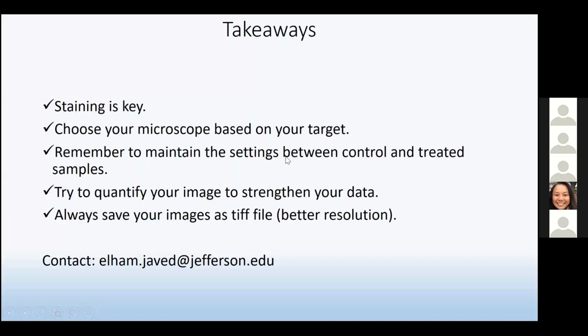So I'm going to finish it off here, and open more time for question and answer. Again, just a couple of takeaways: please remember, staining is the key. Make sure your staining protocol is spot on. It actually takes a lot of trial and error to get good staining for different proteins. It's not one and done for each and everything.